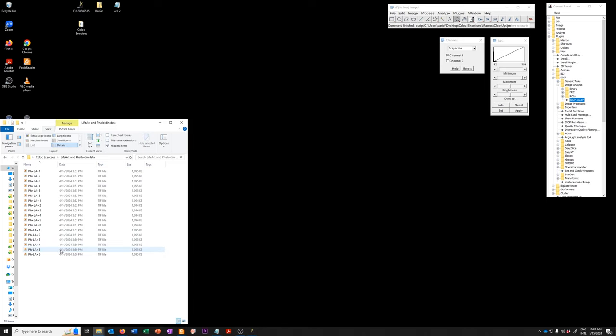One which has both phalloidin and LIFACT, one which has phalloidin but not LIFACT and one which has LIFACT but not phalloidin.